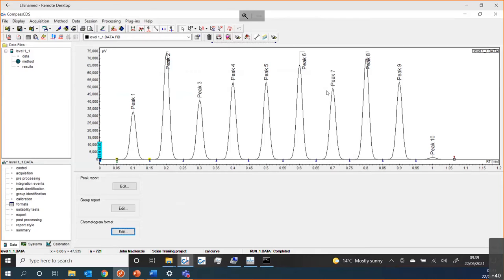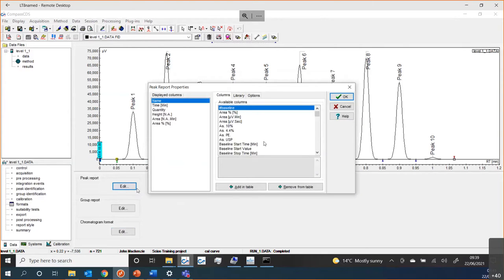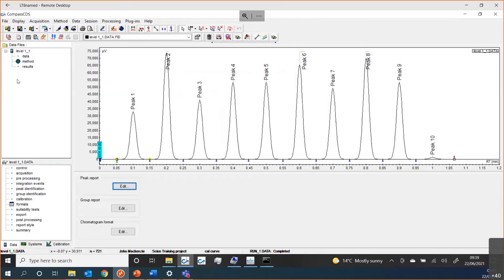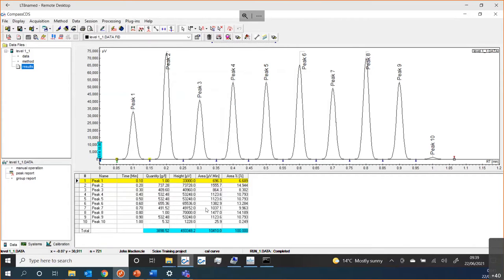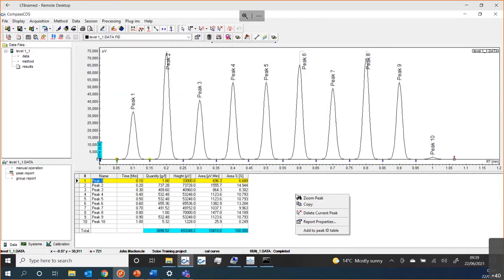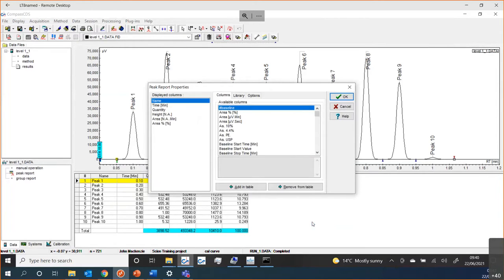The other thing I should mention while we're in here is what's called the peak report. Right now we can't see the peak report on screen, so let's go over to that. My peak report at the moment shows peak names, retention time, calculated quantity, height, area, and area percent. Maybe these are things that I want or maybe they're not. I could use my Formats section to control that, or I can just right-click and choose Report Properties and select what things I want in my report.